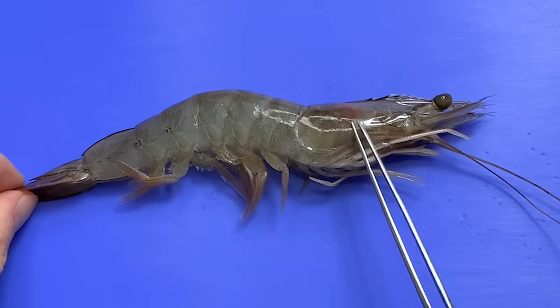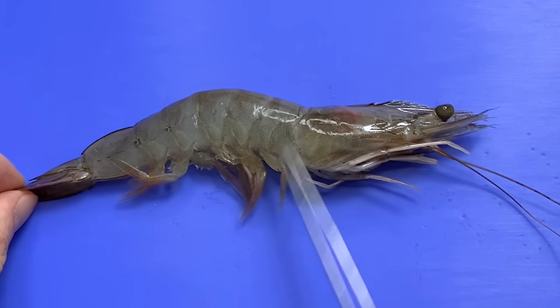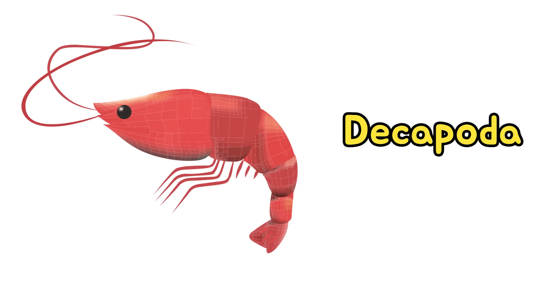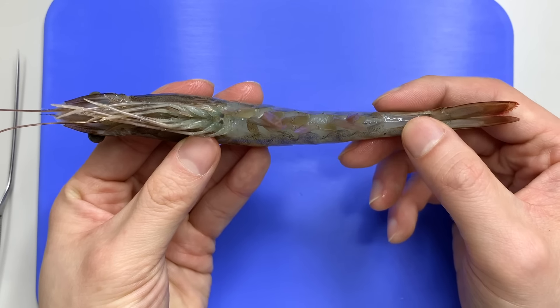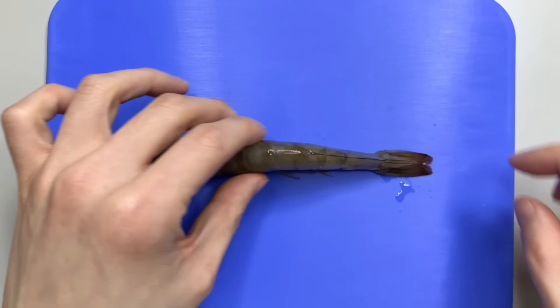And these are the eyes. Like a crab's eyes, shrimp's eyes have a cornea at the end of the eye stalk. Crustaceans have insect-like compound eyes. The part called the head of the shrimp is the cephalothorax — where the head and thorax are surrounded by the carapace. So most of the internal organs are inside here. The part that we usually eat is the abdomen.